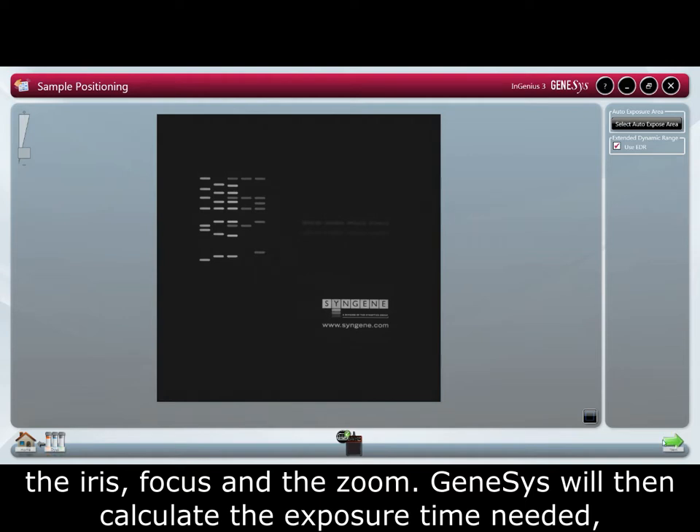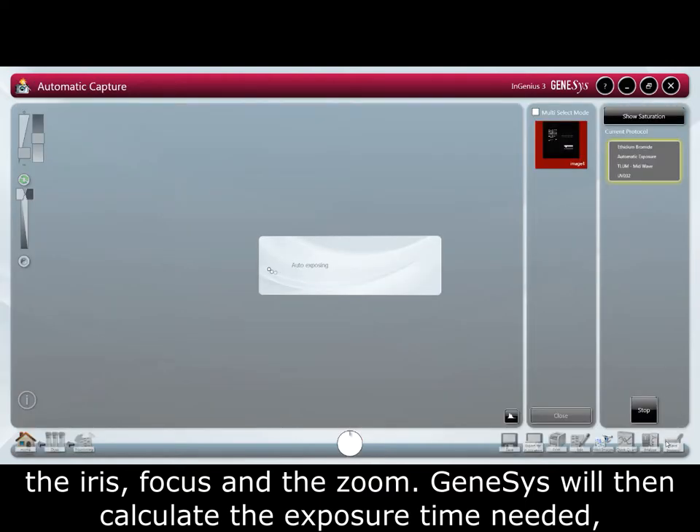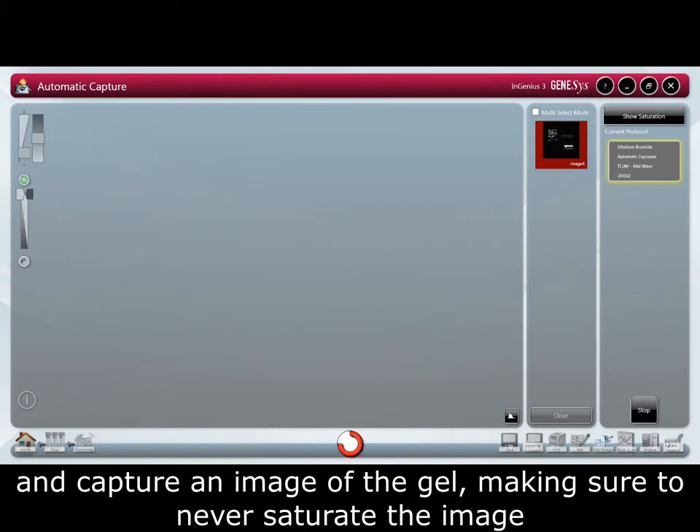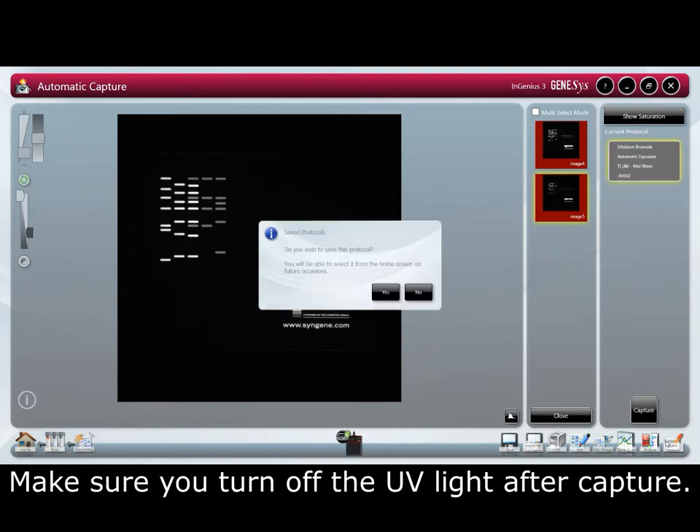Genesys will then calculate the exposure time needed and capture an image of the gel, making sure to never saturate the image. This is important for quantification purposes. Make sure you turn off the UV light after capture.